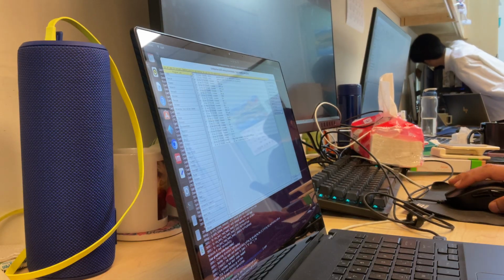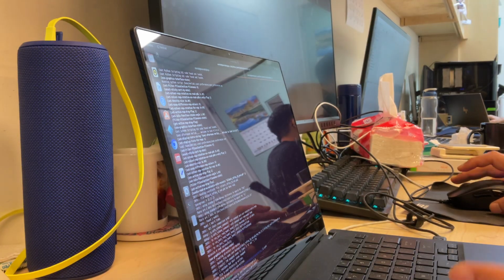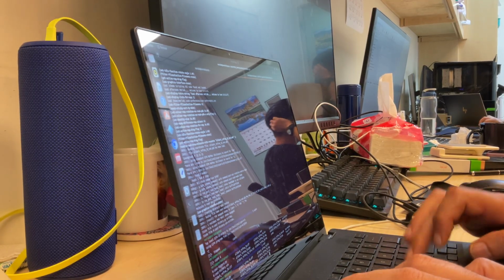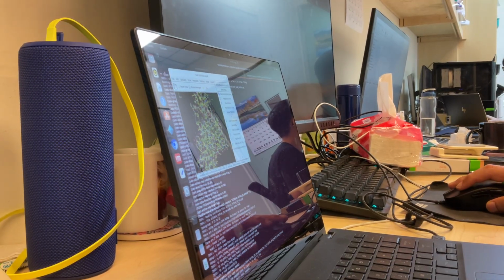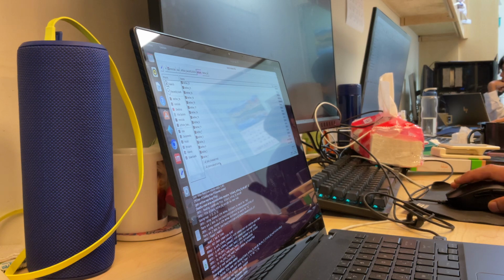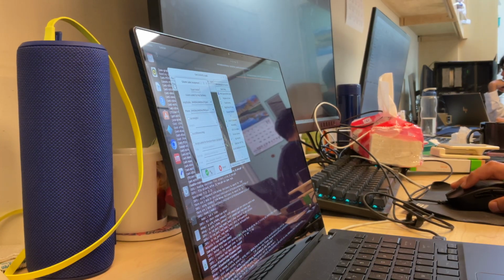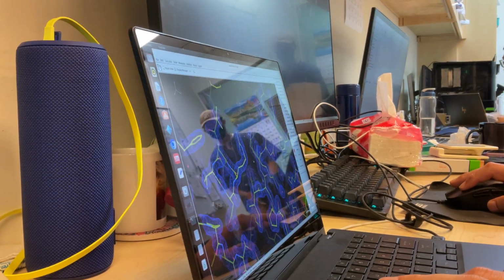Okay, so now it's done. So now here we have the new data files. And so if you want to, we can take a look at it. All dark, refine 28, no H. And now we can open MTZ. Then we can take from here, all dark SFO, okay? And so we can take FC dark and PHIC dark, and we run it. And so this is the calculated map.